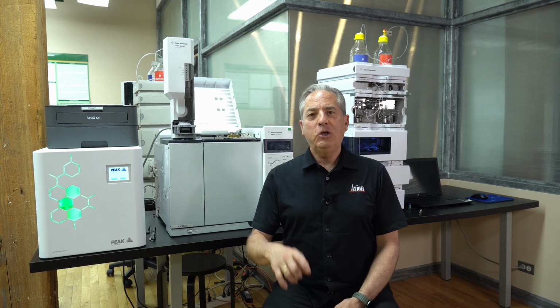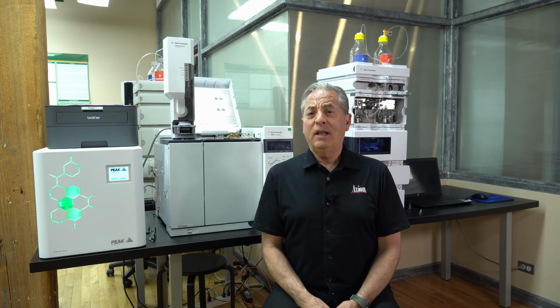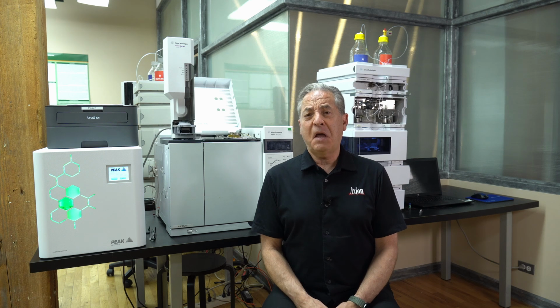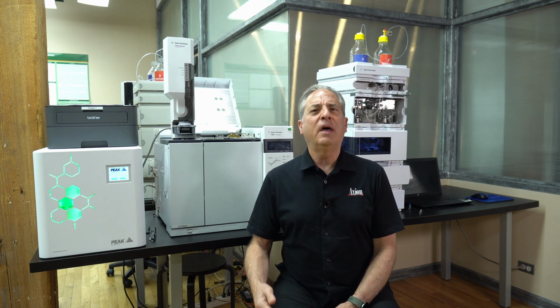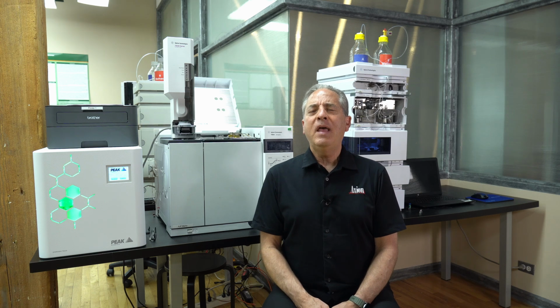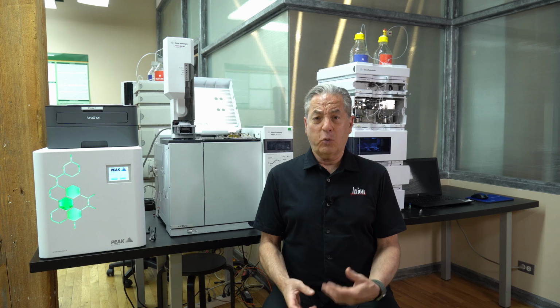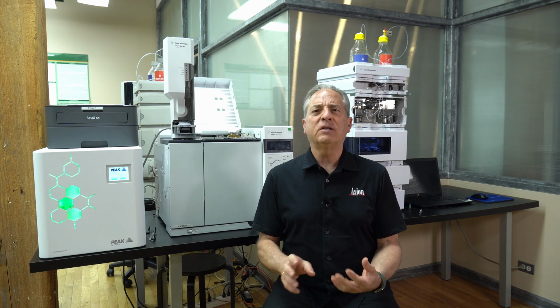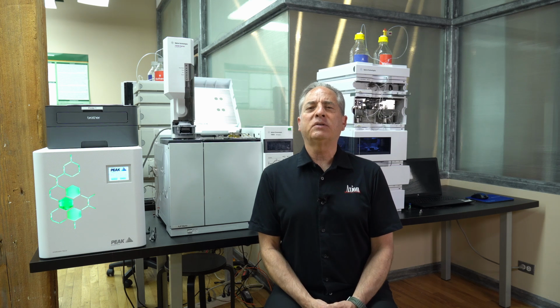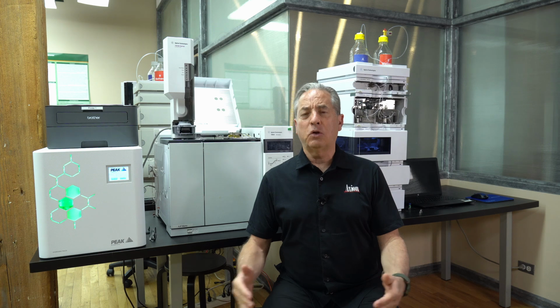For example, you have a standard. How often do you need to make standards? Well, let's run a standard today and tomorrow and a week from tomorrow, left at room temperature. And then a week later, a month later, 2 months later. And then let's age a sample, and we can aggressively age a sample by putting it through heat treatment and that sort of thing. So you will establish that the standards must be made up within 2 weeks, otherwise they're no longer valid.